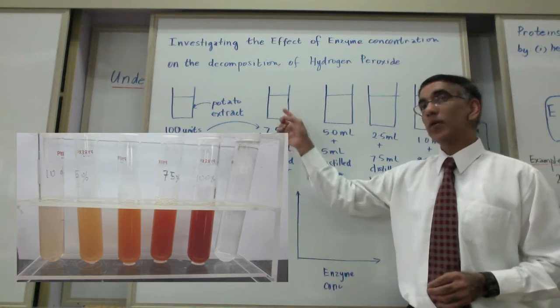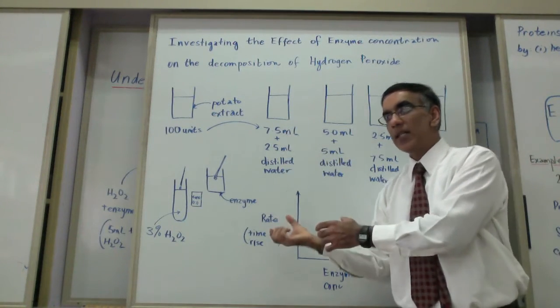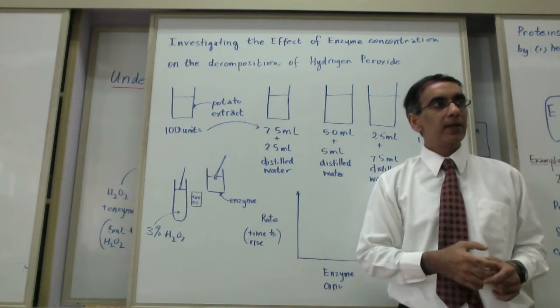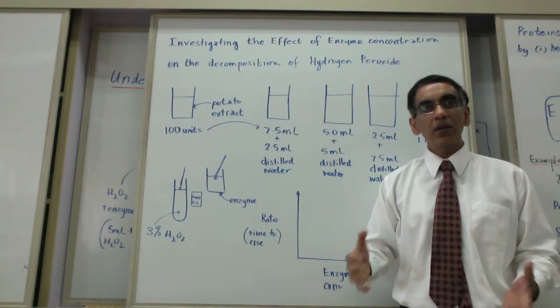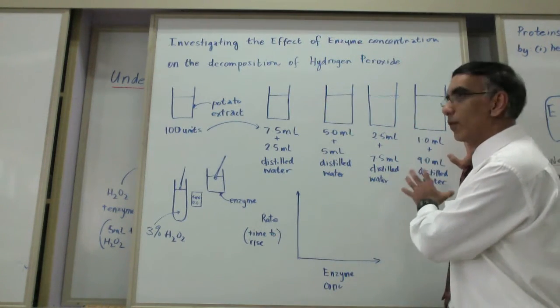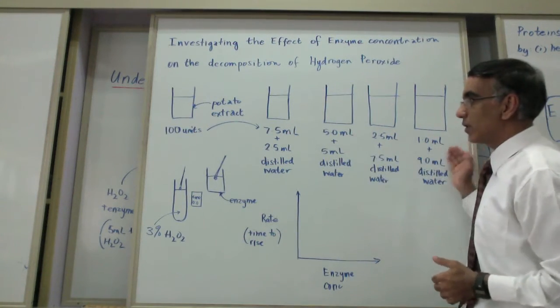Again, the reason why we recommend that you do have 5 is because when you take the raw data and you put it into a process data table, the standard deviation would not be valid if you don't have enough trials. Today we're going to focus on making these 5 dilutions following these directions that you see up here.